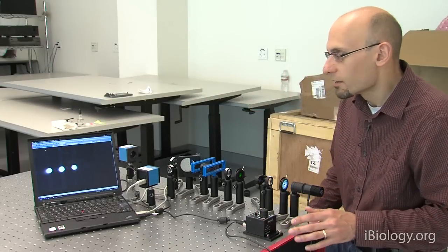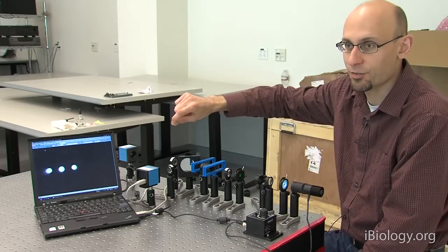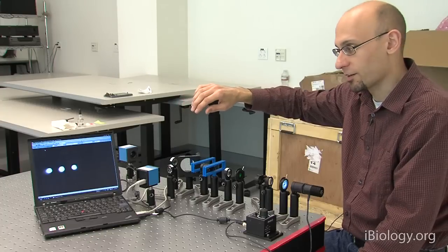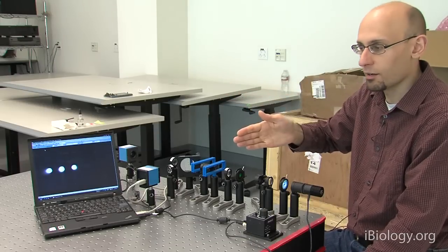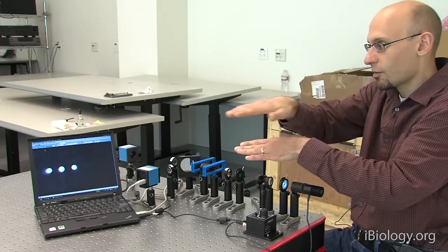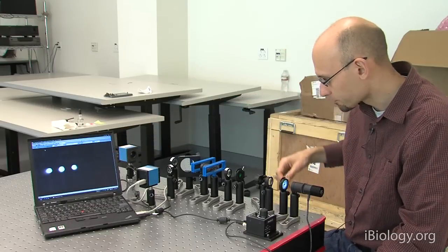The other thing to realize here is that not only does the position here tell you something about the size of the structures, but it also tells you something about the direction of those structures. So both the gratings we've looked at so far are vertically oriented lines. And so a diffraction grating with lines oriented vertically is going to scatter light perpendicular to the line orientation. And so that's why we get a line of spots here that's in the horizontal direction.